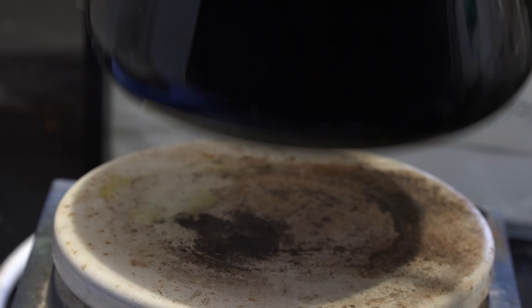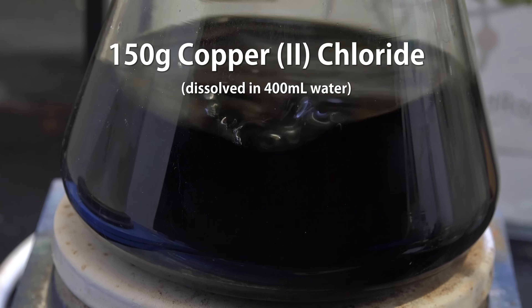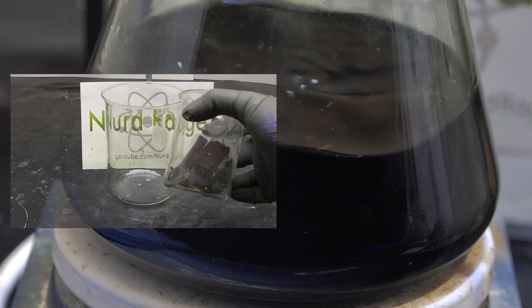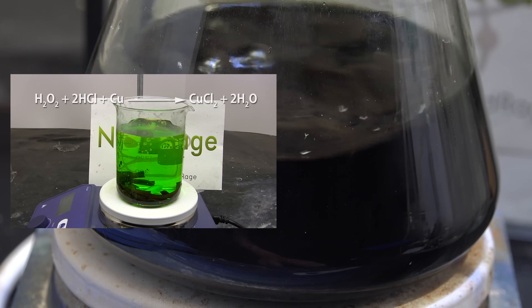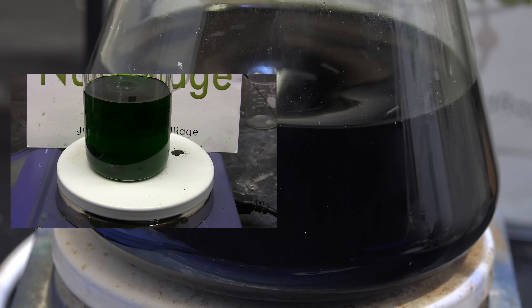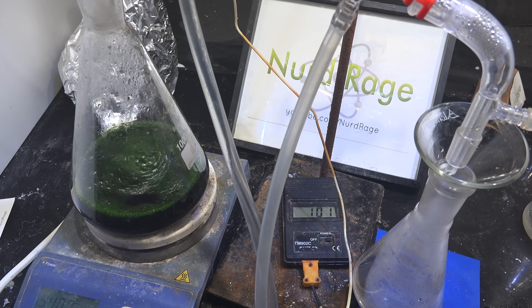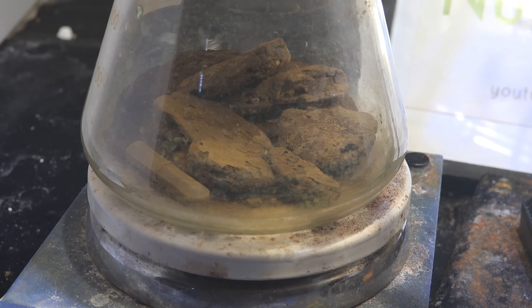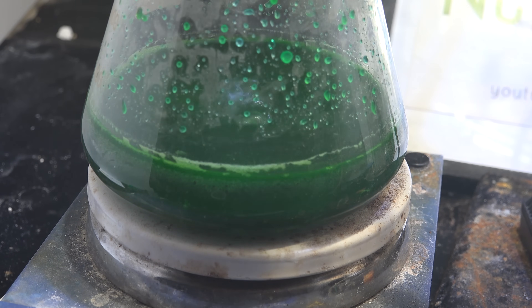First we need a solution of copper chloride. I have about 150g in 400mL of water. This was made in a previous video using copper metal and hydrochloric acid, and used as a printed circuit board etchant. The mixture for printed circuit board etchant tends to have a lot of excess hydrochloric acid. It can still be used for this video, but to help see the chemistry I distilled off the acid first and then added clean water back in.